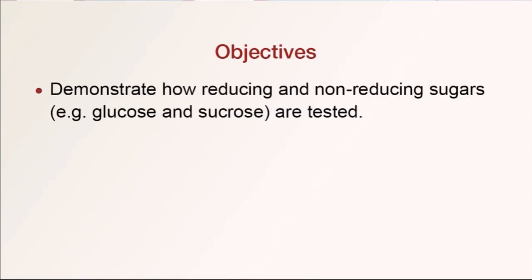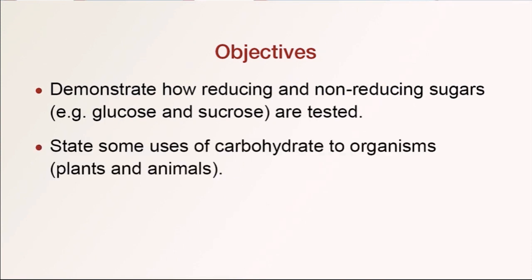With me to have this discussion is Mr. Kingsley Asiedu, and on my extreme right is Mr. Asiamah Kuffuour. By the end of this discussion, you will be able to demonstrate how reducing and non-reducing sugars are tested, and state some uses of carbohydrates to organisms.